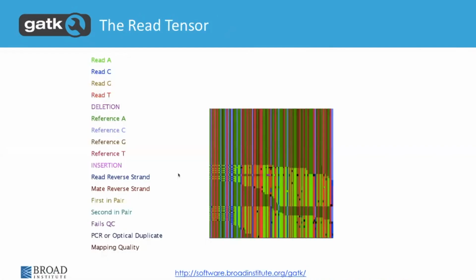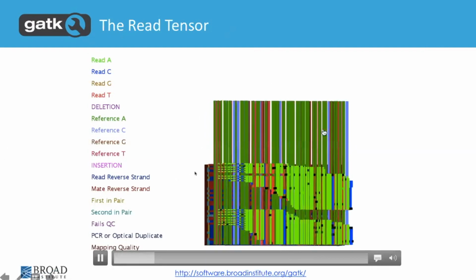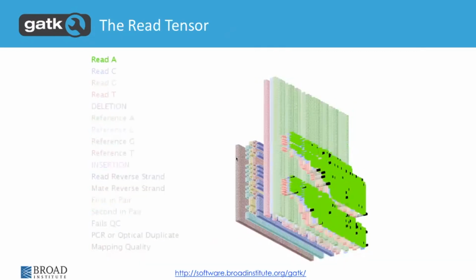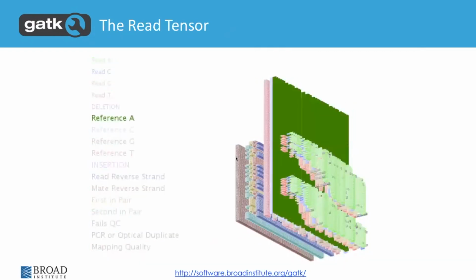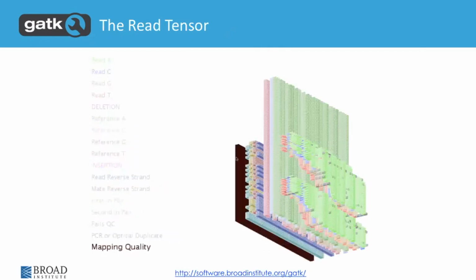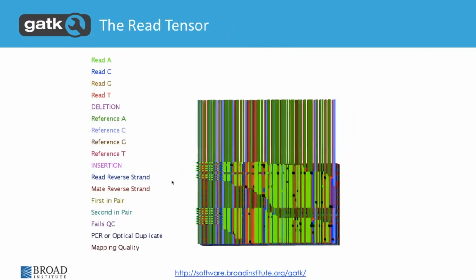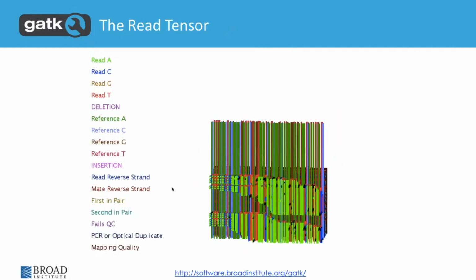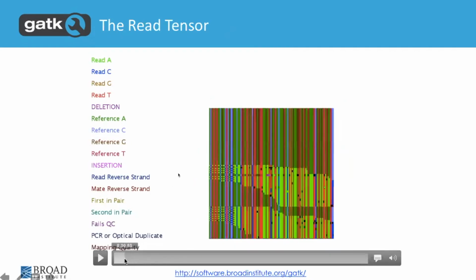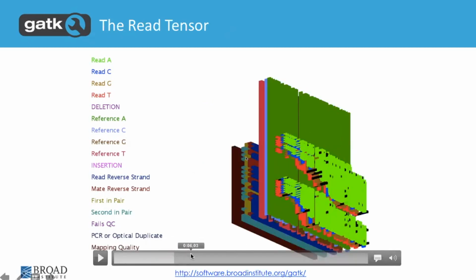And so this is just to give you an idea of what the input will look like. This block represents everything in the BAM around this particular variant, the entire context. These guys in front are the reads themselves.